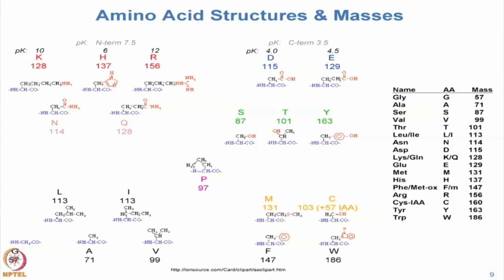We do positive ion mass spectrometry. It's possible to do negative ion mass spectrometry. I've been doing this for 25 years. I never do negative ion. Okay. To me, if it was negative ion, it would be totally boring because you can't do peptides very well that way. All right. But what I give you some property information here.